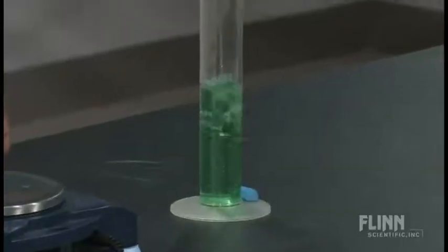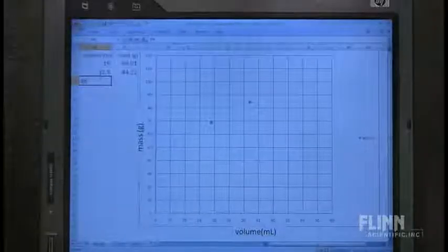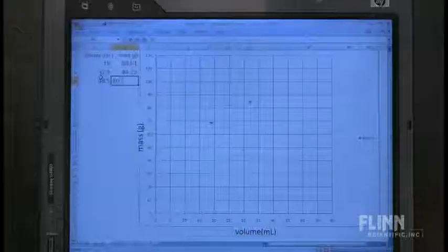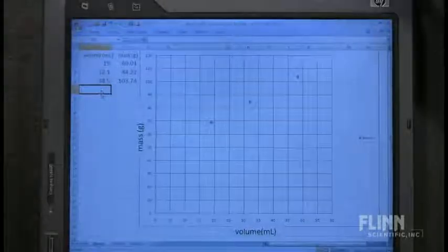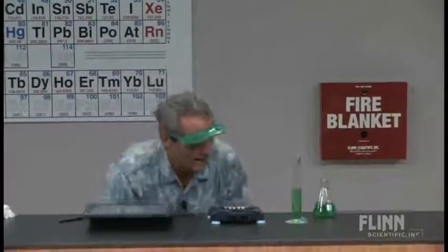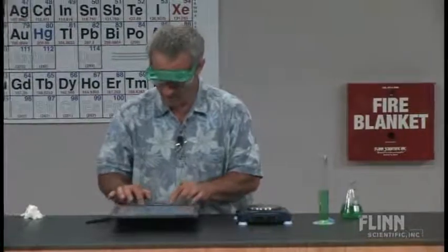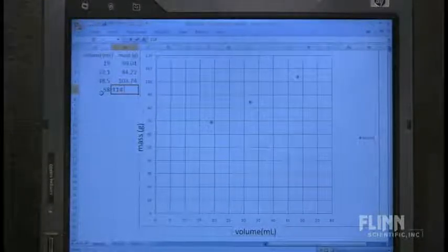Another 15 to 20 milliliters more. I'm going to call that 48.5 milliliters. I'll enter 48.5 and put it on the balance — 103.74 grams. We're getting a nice little relationship here. We're going to add one more point. I won't go past 60, so this will be a close point. I'm reading 58.0 milliliters, and on the balance I'm getting 114.95 grams.